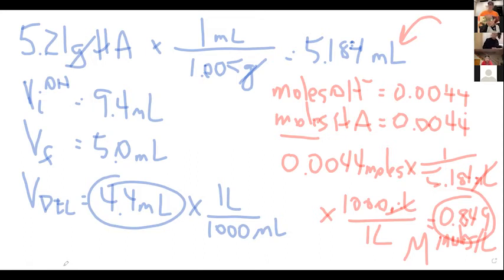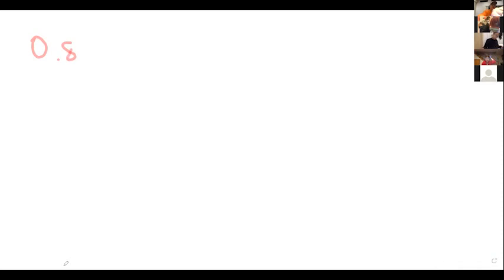So now I'm going to use that information to figure out my mass percent. So 0.849 moles per liter, that is what the concentration is.